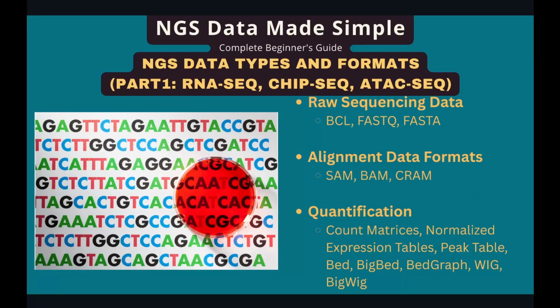So far, we have covered most analysis in RNA-seq, ChIP-seq, and ATAC-seq. If you have followed along, you must have noticed that the hardest part of NGS analysis lies in the navigation of Linux system and the usage of command line tools. Unlike tools with beautiful graphical interface, command line tools are text-based. To most people, they are like black boxes. You don't know what's going on under the hood, what they are taking in, and what they are spitting out. The easiest way to solve this problem is to understand the data structure by directly visualizing the data.